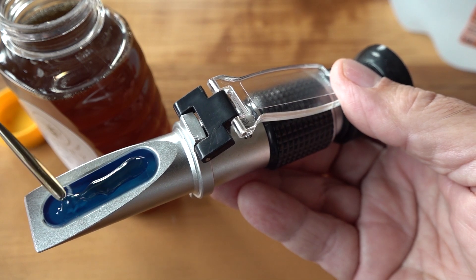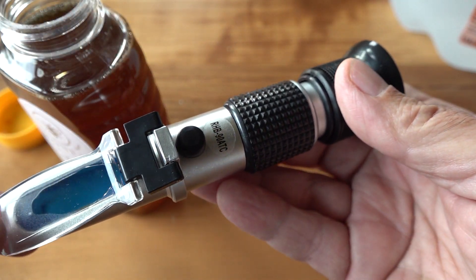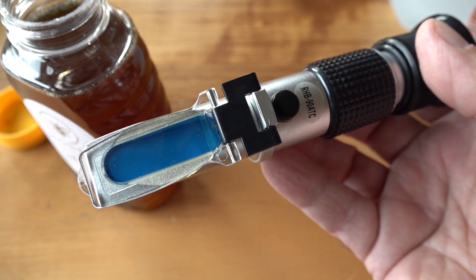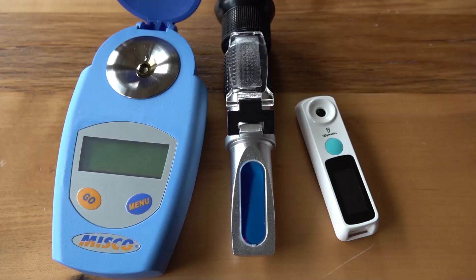We put the honey over the entire lens. This is refracted light — it comes at other than a 90-degree angle, and the lens already has a bevel on it. This requires no batteries — just daylight. Make sure the honey completely covers the blue area with no air bubbles. Looking through it now with my special camera gear so you can see it too: that's about 17.6% water, right where the blue engages the light band. So this very inexpensive refractometer reads 17.6% and the expensive MISCO reads 17.5% — they're right on par with each other.